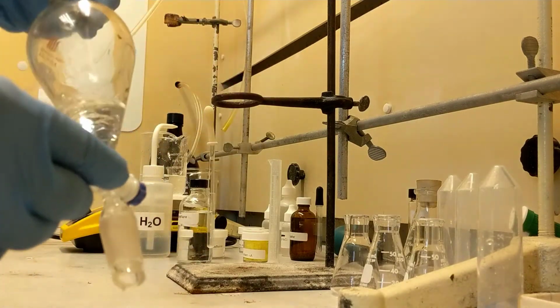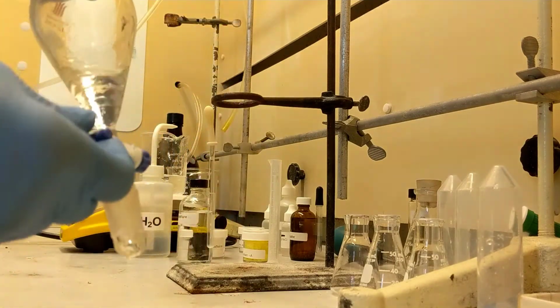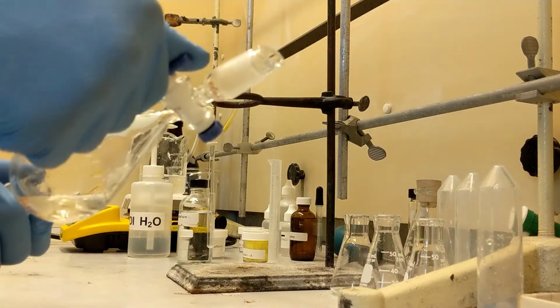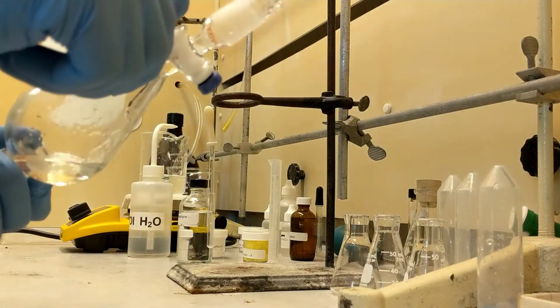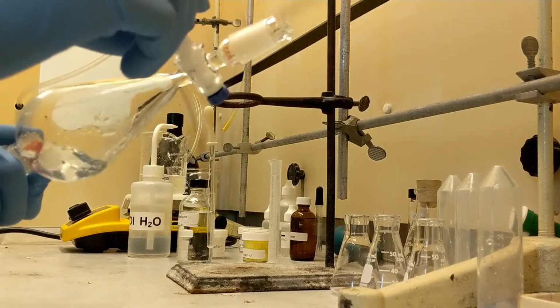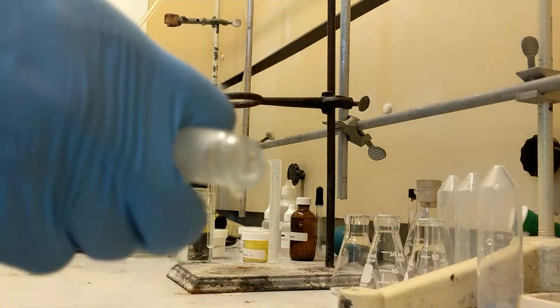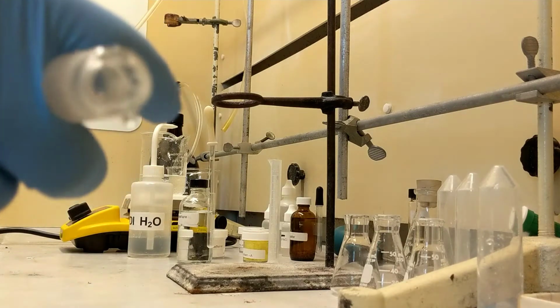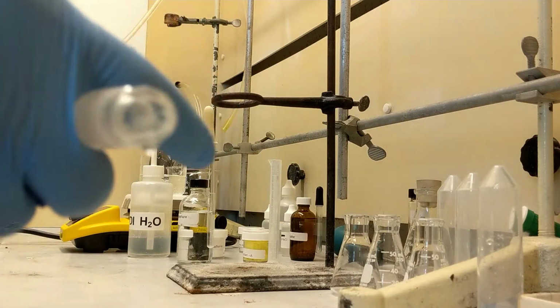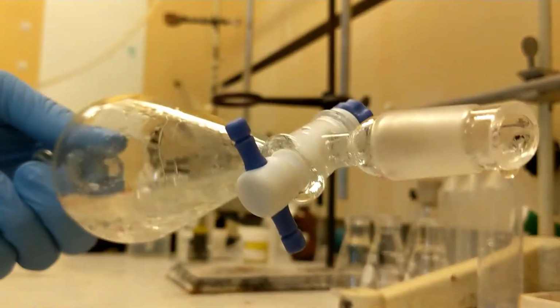So I'm just going to do this for a couple minutes. Make sure that I'm releasing the pressure. You can see the pressure is getting a little weaker now. So I feel a little better about starting to shake this, okay? So now I'm going to shake. Not vigorously, not trying to shake the heck out of it, but just trying to get the caffeine out of one mixture and into the other.